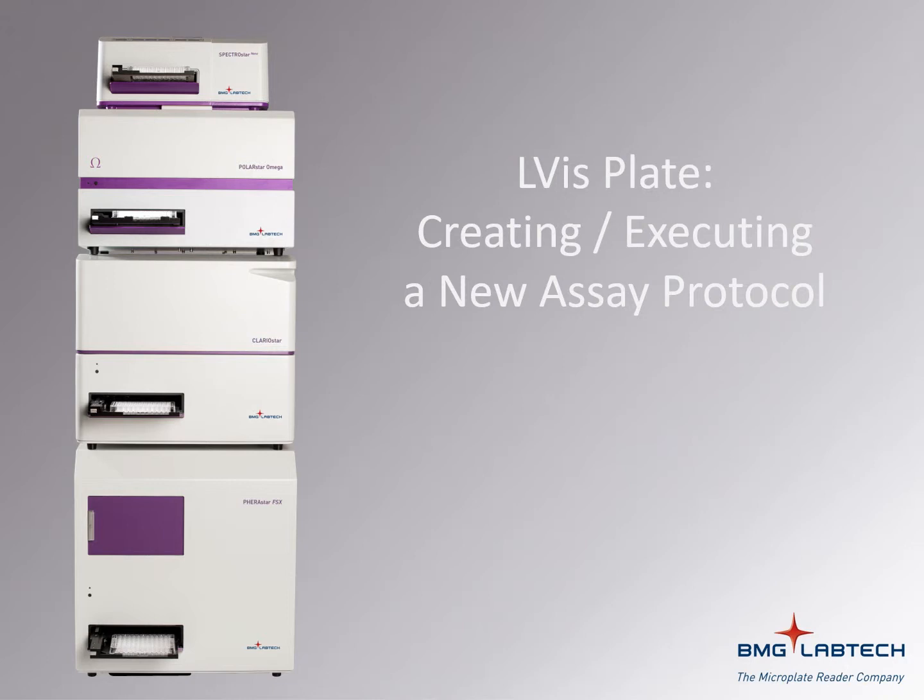Then, using the data collected with this protocol, we will see how spectral data can be further analyzed by adding a discrete wavelength, then using the absorbance values from this wavelength to perform a linear regression fit.